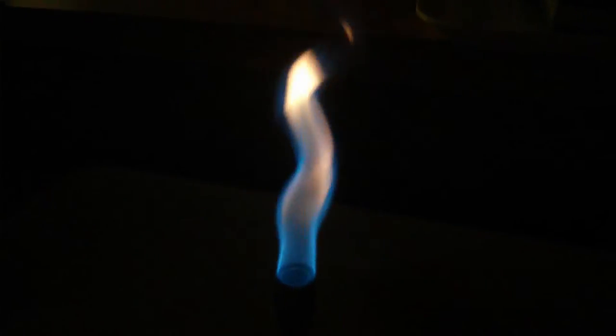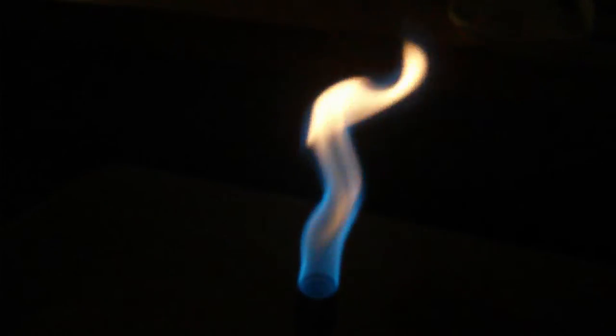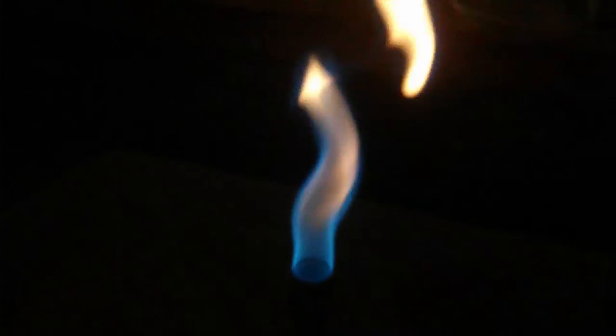Let's talk a bit about flames. Not all flames are created equal and not all kinds of flames are good for flaming, which is sterilizing your inoculating loop when you are doing microbiology work.